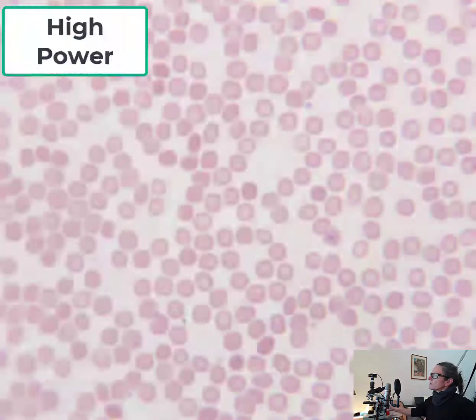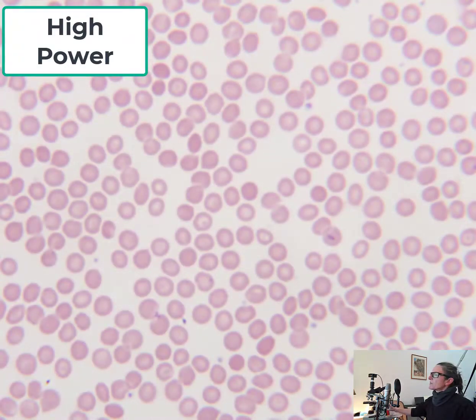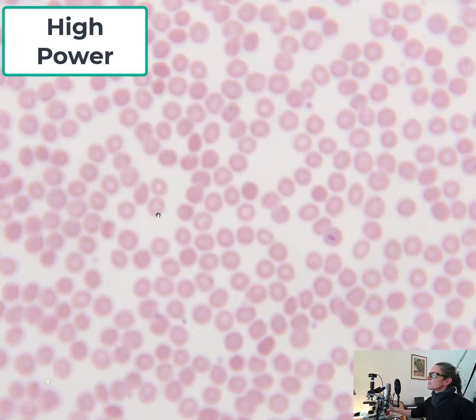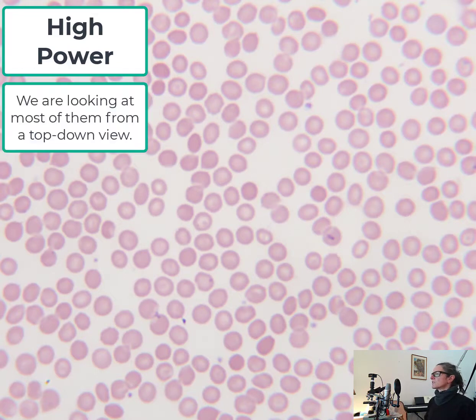And we will see, on close inspection, the erythrocytes really do look kind of like pink donuts. In this case, these are probably in a little bit hypotonic solution, and some of them have swelled a little bit and have probably taken on some water. But nevertheless, they still retain this kind of pink donut shape. And that's due to the fact that these are like little discs that are thick on the outside, get progressively thinner in the center.